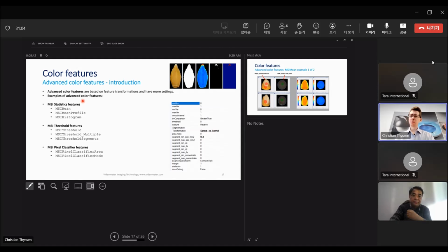So are you asking specifically about the feature? Yes, it's about the blob function. Forget about the color picture and the CDT. When we need to predict the germination test with the blob function, how about the way I usually make the area with the whole grain? If I use the short area instead of the whole grain, maybe the prediction of the germination could be increased or not.